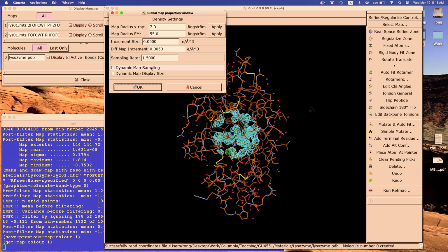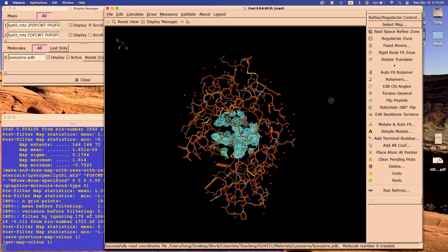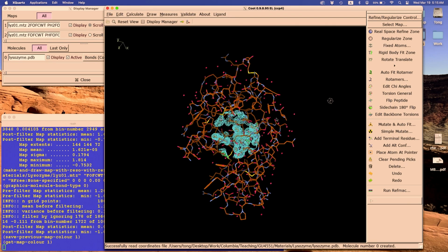So put in 7 or whatever number you like, and then that'll change, and then say OK. Did that work? Yes. Good. All right, so everybody's on the same page now? Yes. Okay, so now we need to start building.